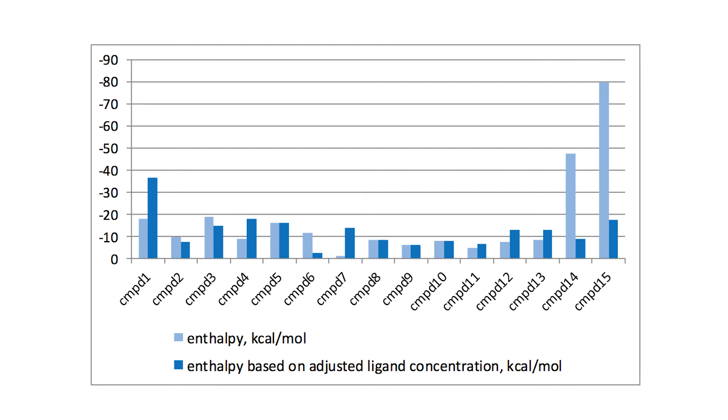This figure shows a comparison of the enthalpy data returned for the interaction of a series of low molecular weight hits with a target protein in a drug discovery program, with and without the correction for ligand concentration. The compounds are listed in order of descending affinity. Notice the discrepancies introduced when errors in ligand concentration are not accounted for.